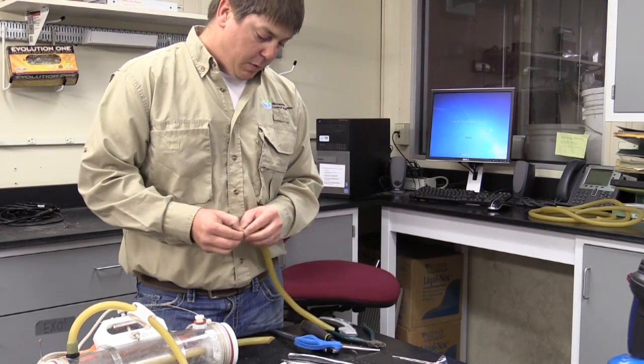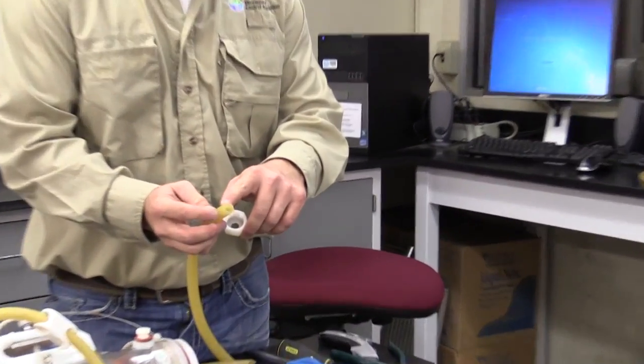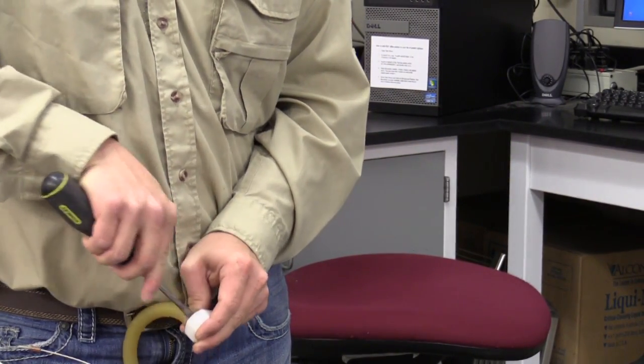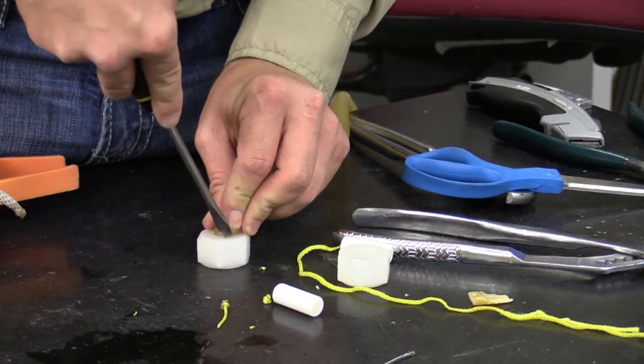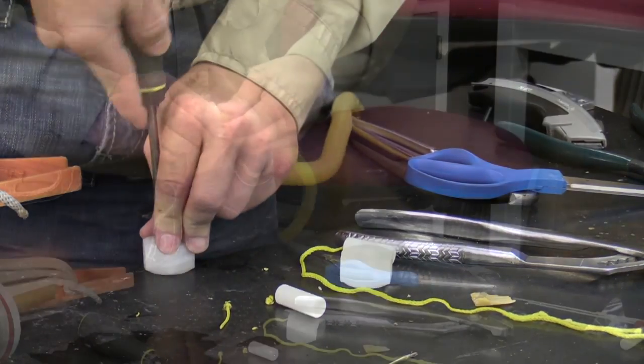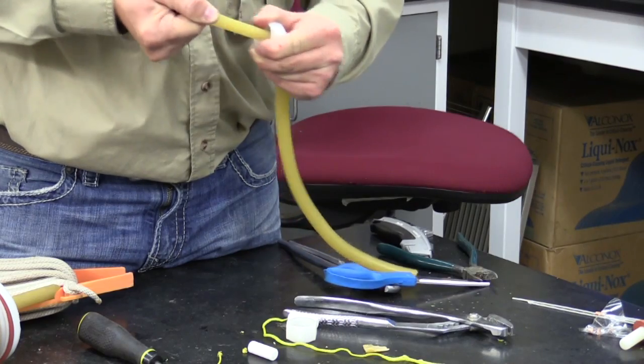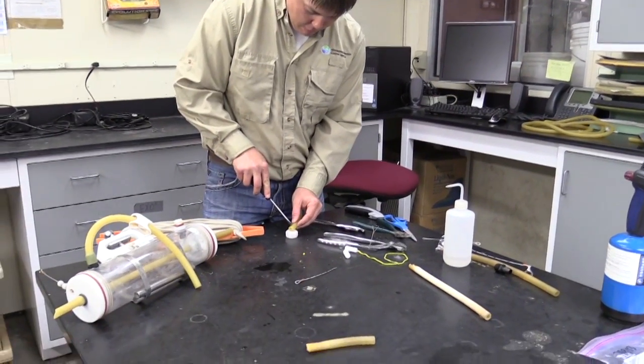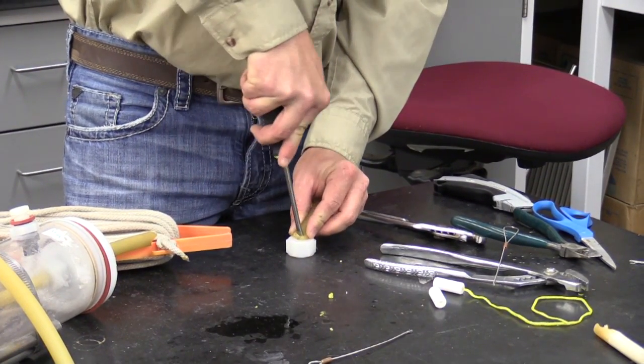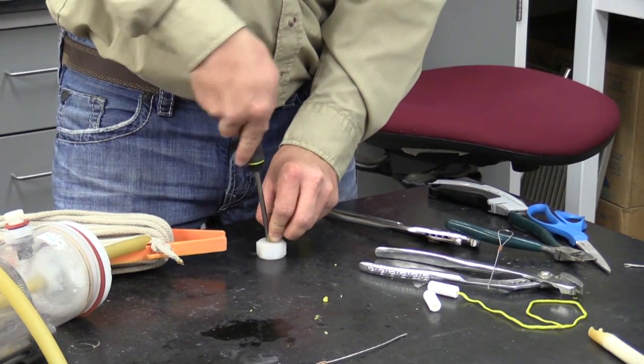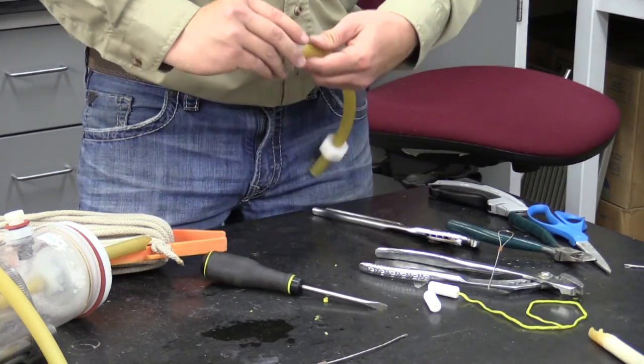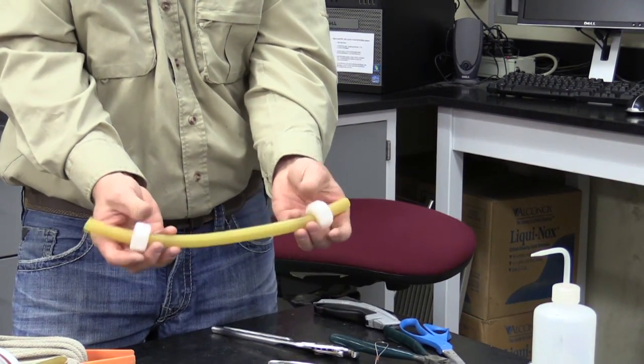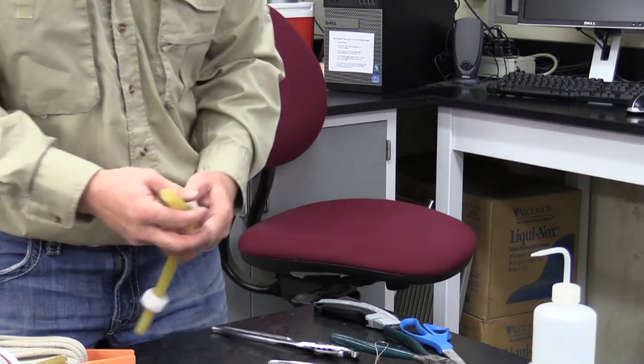This next part can be a little tricky. You have to try to get this hose into this nut here. A lot of times I'll try to get it started with a screwdriver. It takes a considerable amount of twisting and finagling. But it will go. So once you get the one side on, you want to do it.